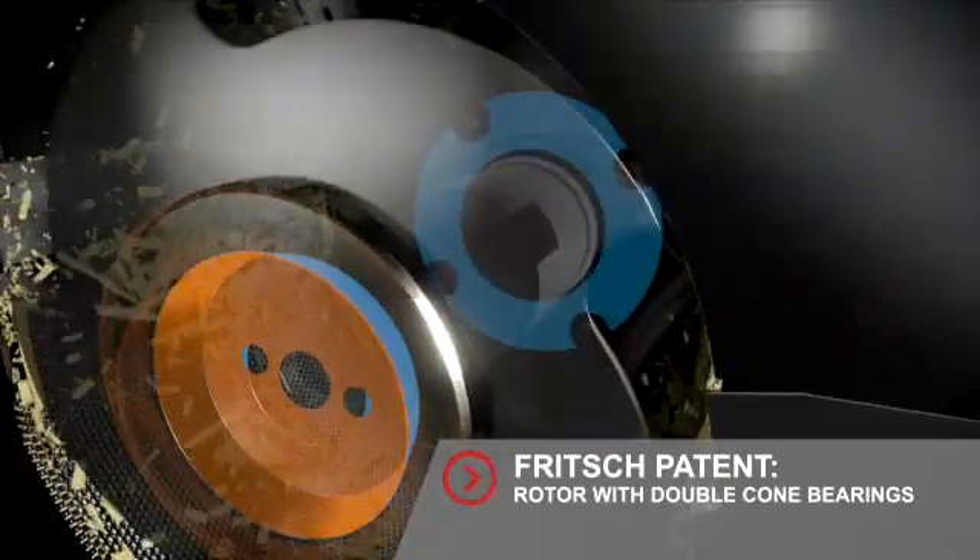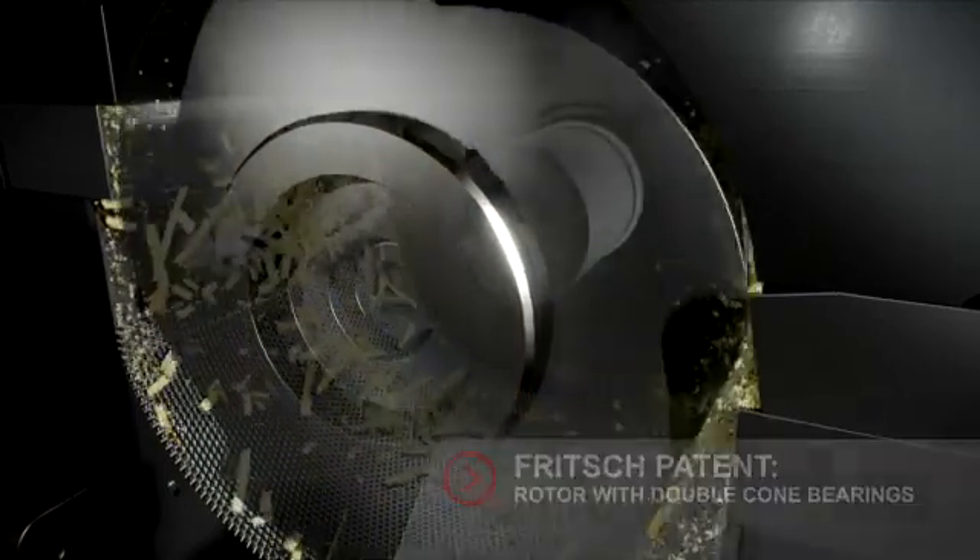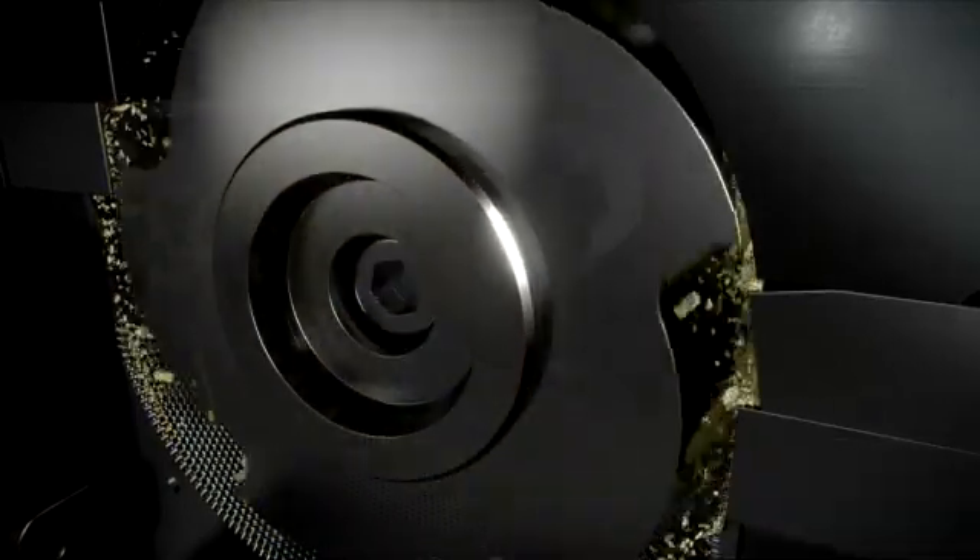The rotor has double cone bearings on the shaft and in the lid. This patented bearing ensures stable running and minimal wear.